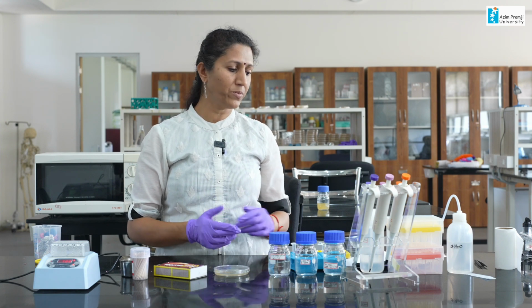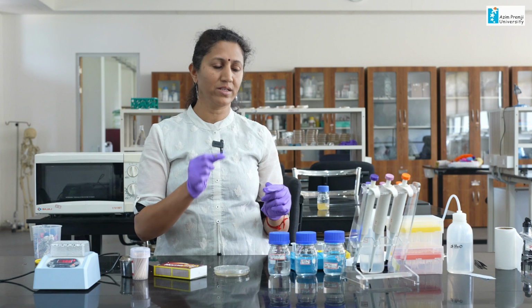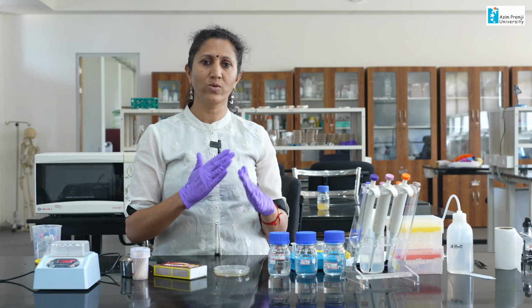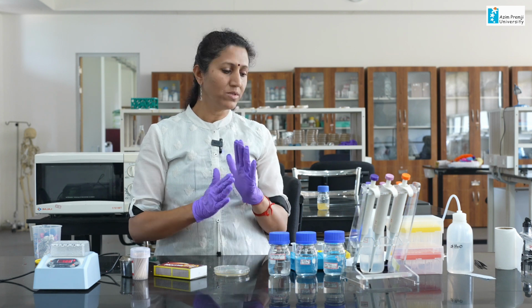Today I am going to show you a bacterial DNA isolation process which does not involve these purification steps, but it is a very simple one step process. Take a colony and use the solution or chemical that is required to break open the cell, and then use this solution as a template for PCR amplification.